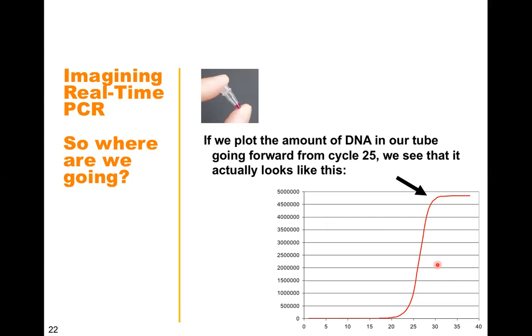If you start with a very high amount, say 1,000 molecules in one case and 10,000 molecules in another, after 30 cycles both will get saturated, and the difference will not be observed in the normal PCR technique, but the difference will be observed in real-time PCR. Why? Because we put up a threshold. Say here the 10 lakh range is there. That will be our threshold, so we put up a line over there. The machine itself does that, and that will be our range. So here is the example.